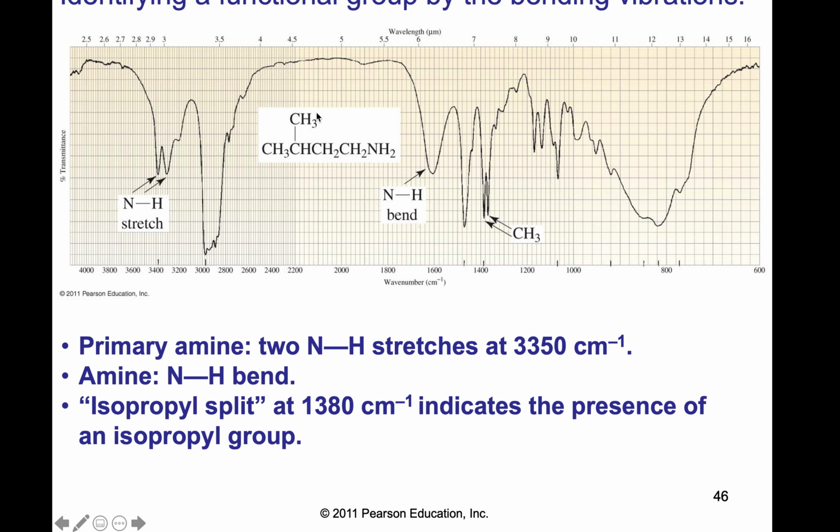This compound actually has a poor man's isopropyl. It's not really an isopropyl, but there's an isopropyl built in if you want to look at it that way. And that split at 1380 indicates you have an isopropyl built in. This split.